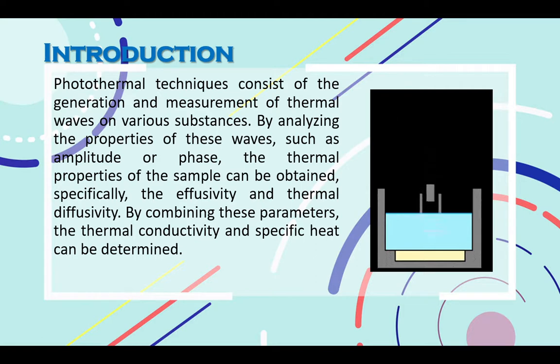Photothermal techniques consist of the generation and measurement of thermal waves on various substances. By analyzing the properties of these waves, such as amplitude or phase, the thermal properties of the sample can be obtained, specifically the thermal diffusivity and effusivity. By combining these parameters, we can also obtain the thermal conductivity and specific heat of the samples.